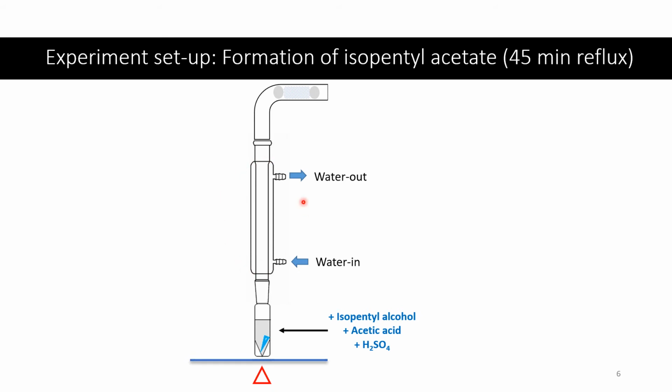Remember, we do the refluxing in order to make sure the reactant volume does not go down during the long reaction incubation time. And we have a drying tube here with 2 cotton plugs having some calcium chloride in between, and the purpose of this is to absorb any moisture.